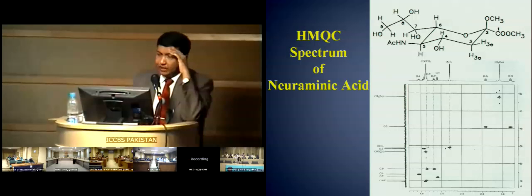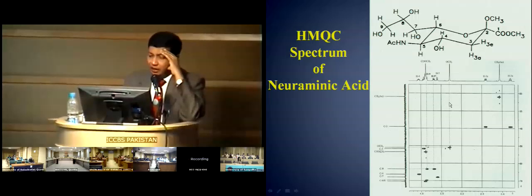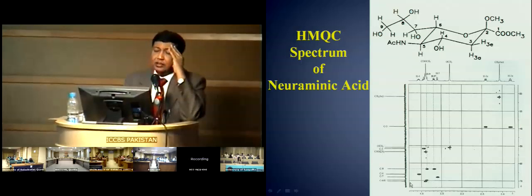Okay, interpretation is very easy. For instance, this O-methyl is correlated with this carbon. There is another O-methyl, which is an ester O-methyl, correlated with, I don't know what, somewhere here or here. This is okay.